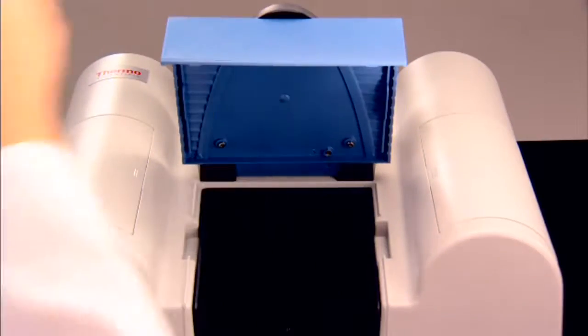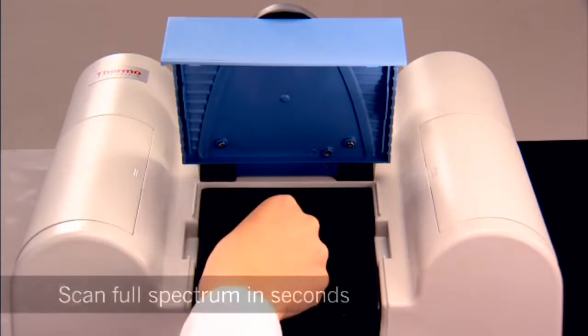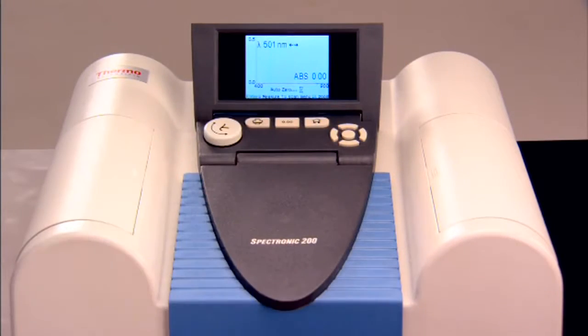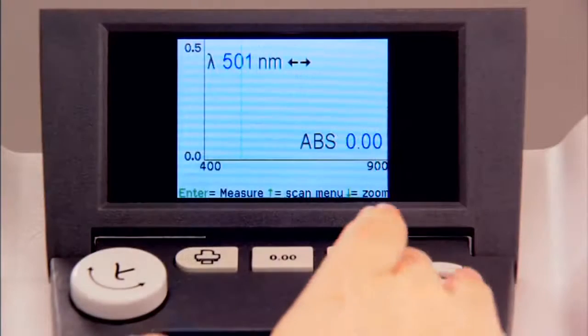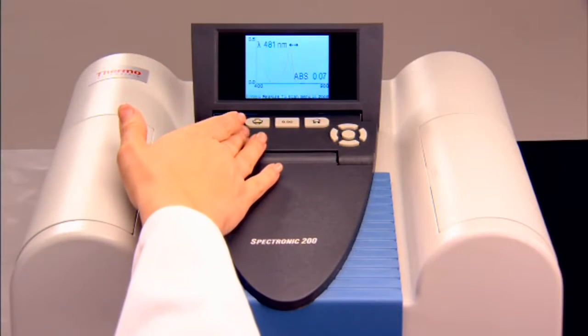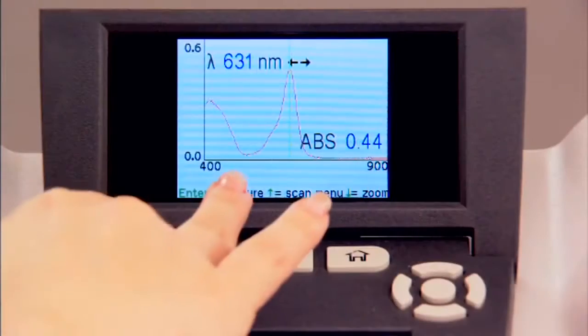The SPEC 200 scan mode gives you the ability to scan the full spectrum in seconds. To find Lambda Max, just zero it, measure your sample, and use the cursor to identify the peak.